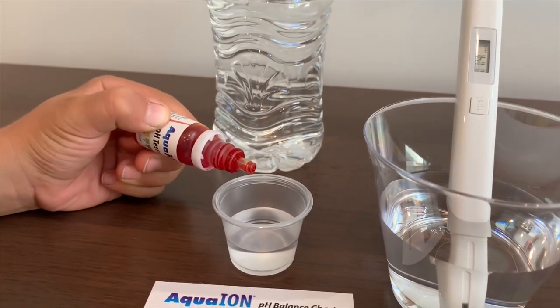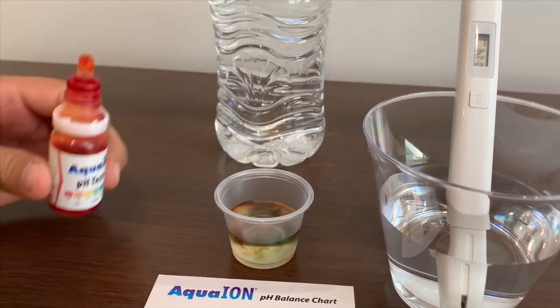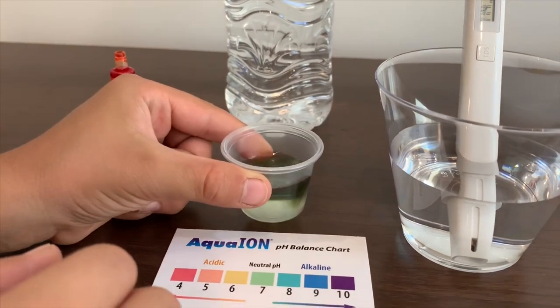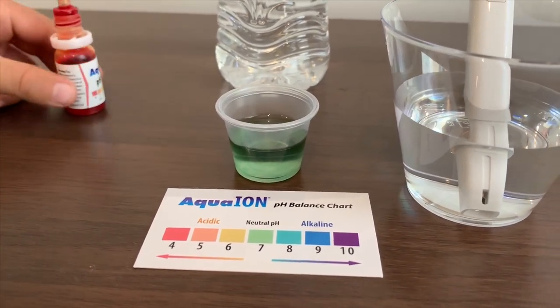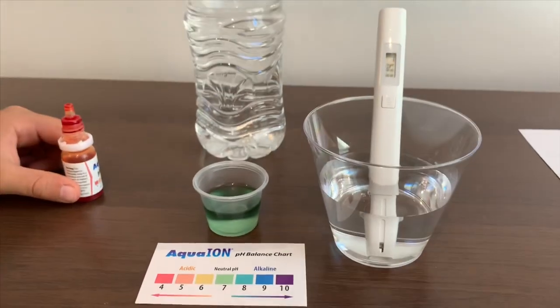Now let's test the pH. Only put two drops in. It is 7. That's naturally pH. That is okay.